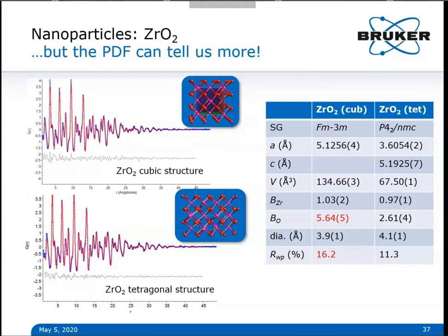I think also in the direction of what kind of samples we can analyze, there are some questions about liquid samples and maybe even nanoparticles in liquids. Can we analyze them with PDF? How do we treat the fact that we maybe have solvent present? Is there something we can do, or do we really need to look to other techniques for this kind of sample?